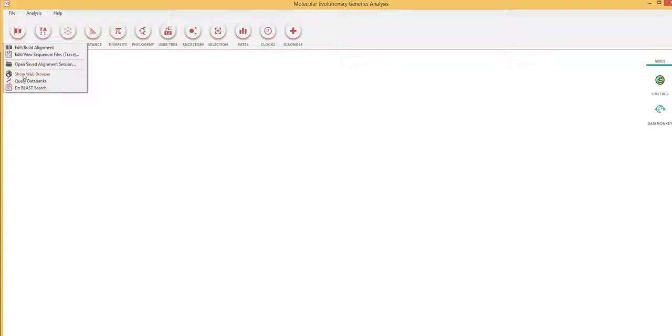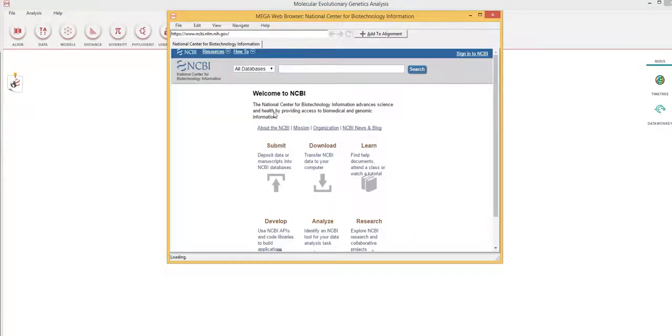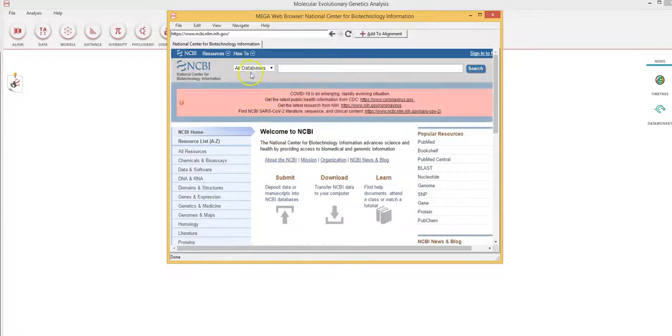In this case, I want to query data banks or use a web browser such as the NCBI nucleotide search to identify and locate specific sequences for this example. So I click on show web browser and it will connect me to the NCBI gene bank.